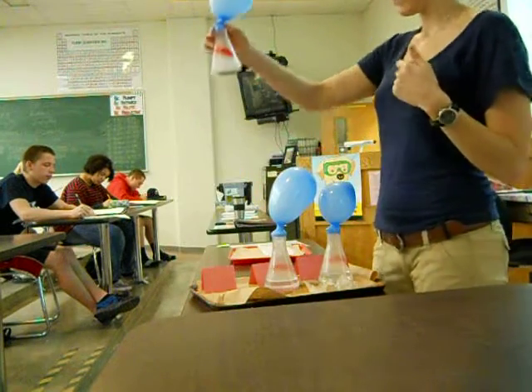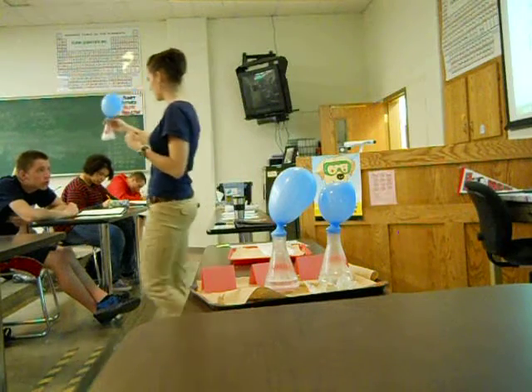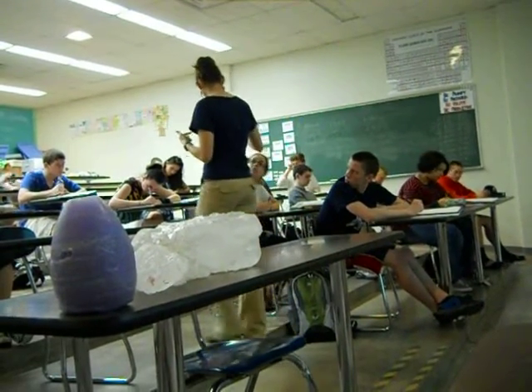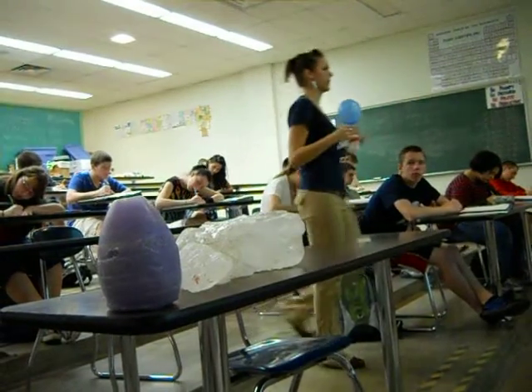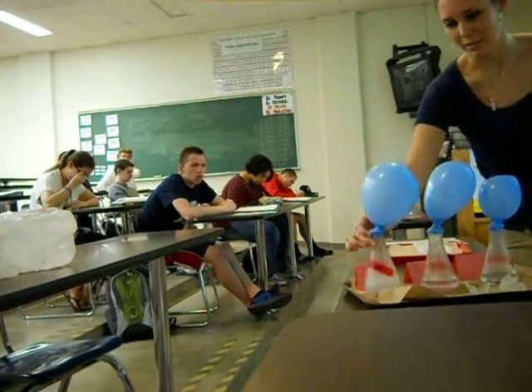So what does that mean for flask C? You can kind of see it. What was our limiting reactant here? The HCl. Can you see the magnesium stuff kind of left over? So our HCl was our limiting reactant for flask C.